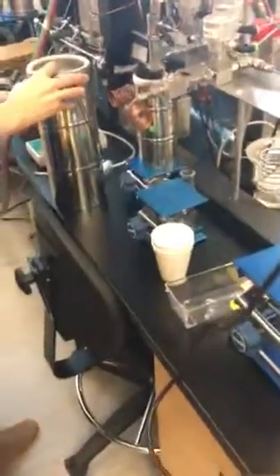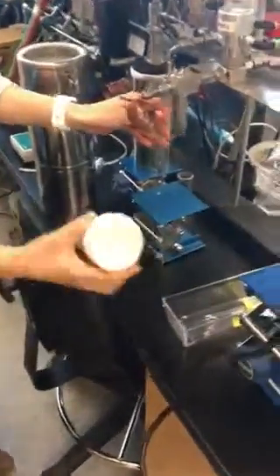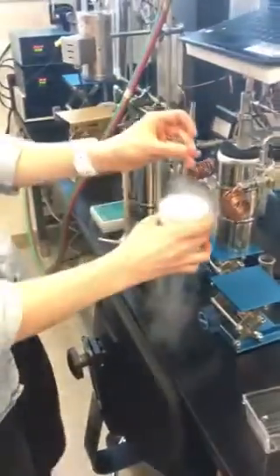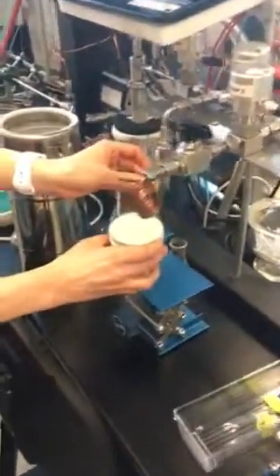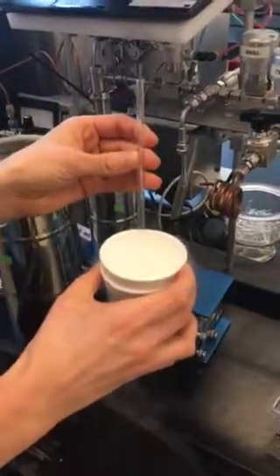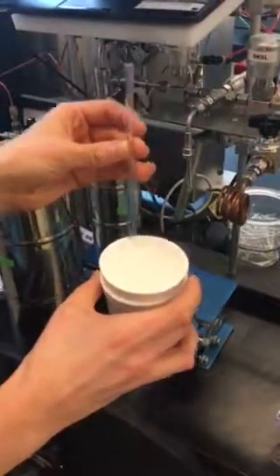So normally we will have a full tube plugged in here. And when we're ready, we're going to use liquid nitrogen on the end of the tube, and that's going to trap the CO2. So you can imagine this plugged into the vacuum line. I'm just doing this in the room. So CO2 from the room is going to freeze into the bottom of, we call this a break seal.